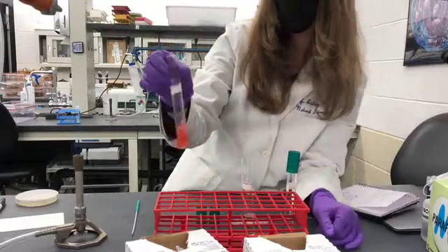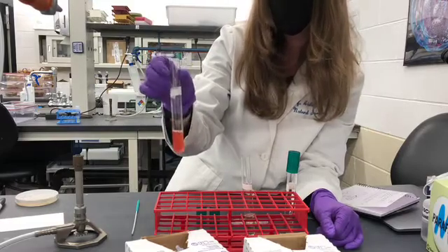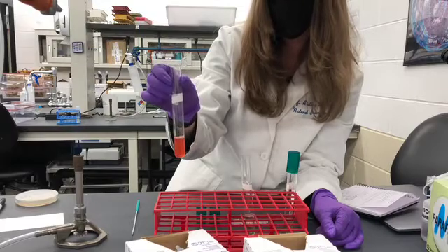This sample, which was E. coli, was able to accumulate nitrite in the media, which means the bacteria has the enzyme nitrate reductase. That means it has to undergo this specific type of anaerobic respiration.